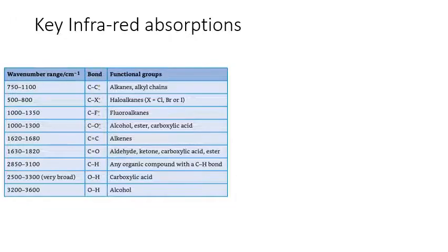So as we've said, it's the bonds that absorb the infrared waves, and the machine measures the wavelength of the infrared that's being absorbed. So let's have a look at this table. It's not unlike the table that you'll get in your data sheet that you can use in your exam. Here in this column we've got lots of different bonds, and here we've got the wave number range.